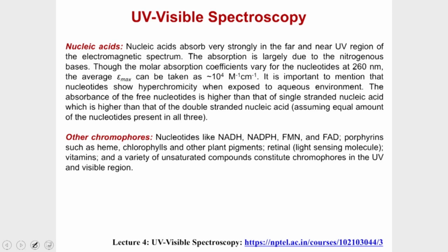That is how it can be used to monitor the percentage of DNA which is present in the form of double helix, or the percentage of DNA present in the single stranded form, because single stranded DNA is going to give you more absorbance compared to double stranded DNA.